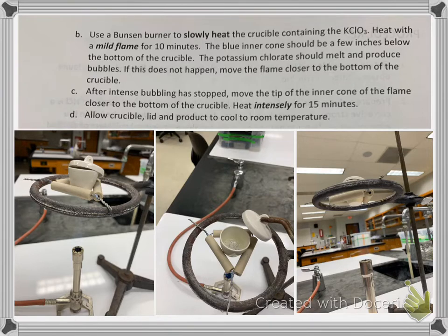So the procedure part, step B, I was heating very carefully the crucible with the potassium chlorate. As it decomposes, oxygen is escaping, and so there's lots of bubbles. So on letter B here, I was just heating it carefully.